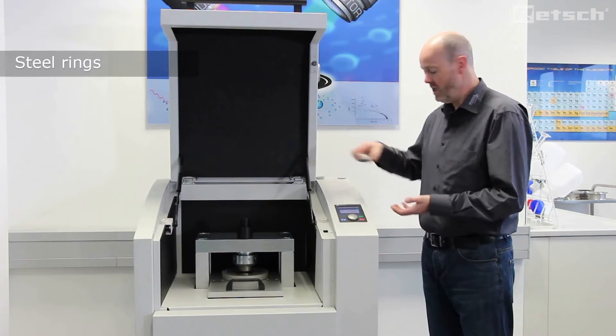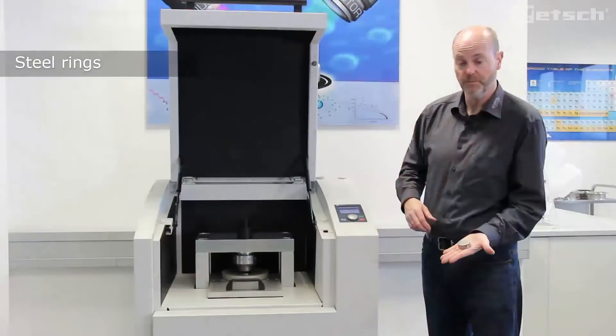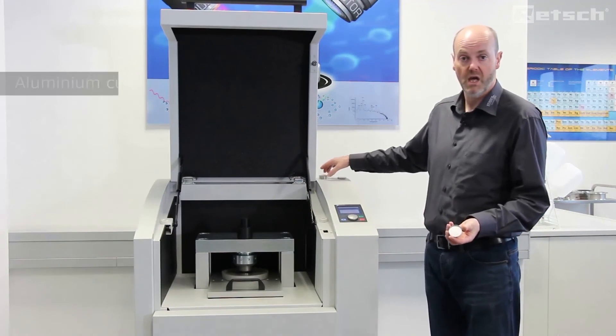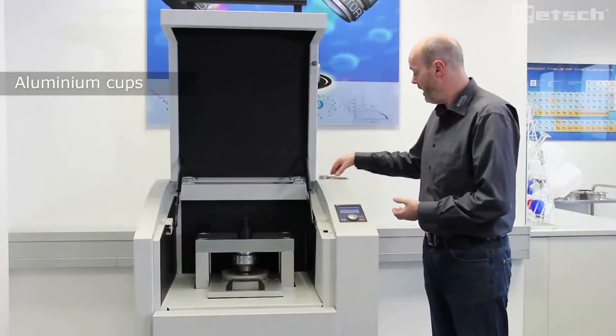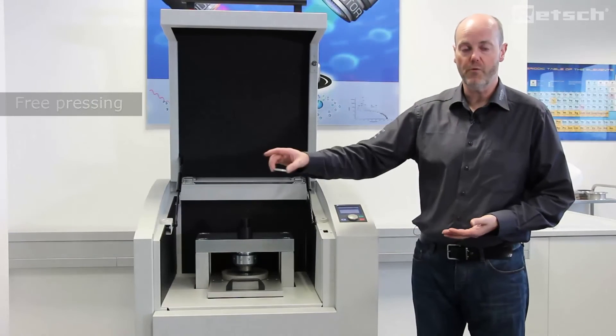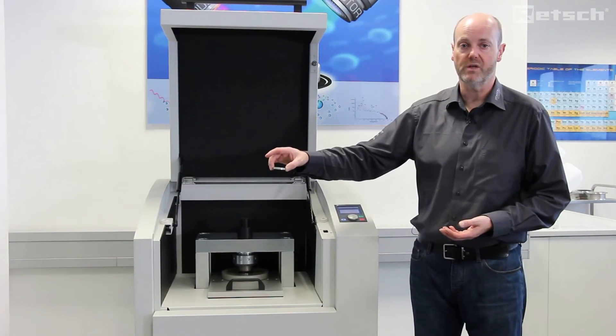Here we can see a steel ring, here we can see an aluminium cap, and this is what we are trying to produce — a pressed powder pellet that will go directly into the XRF analyzer itself.